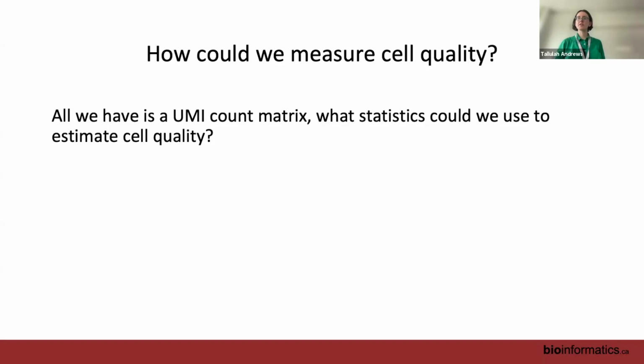So Ottawa suggests using total reads. Yeah, we could absolutely use the total reads or the total UMIs, the total amount of gene expression we detect.